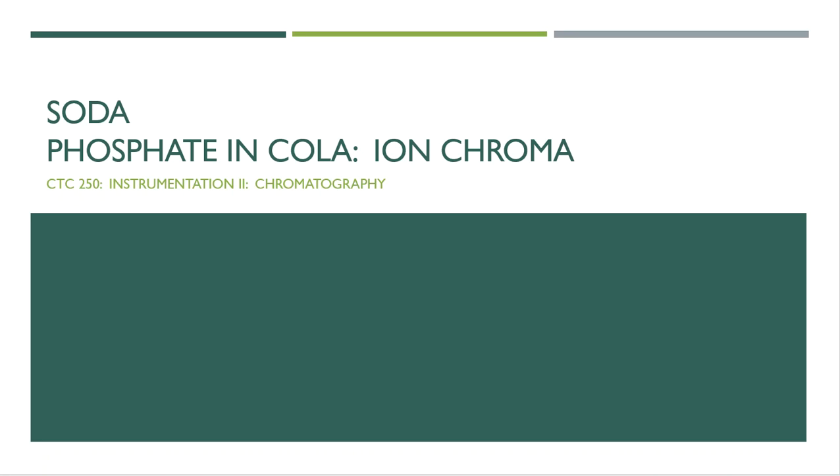And the reason is because phosphate is, guess what? PO4. And this carries a -3 charge. Well, guess what, people? We're talking about a new piece of equipment here, right? And the equipment is the IC system, which of course stands for ion chromatography. Well, if I have ions, I can measure those samples, and it just so happens that phosphate is an ion, so I can run it on this piece of equipment. And that's why we've decided to do this lab experiment for you.